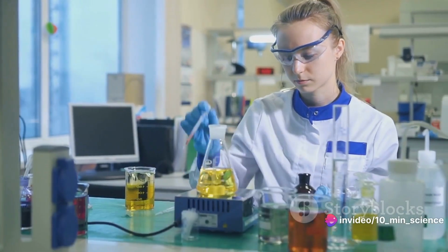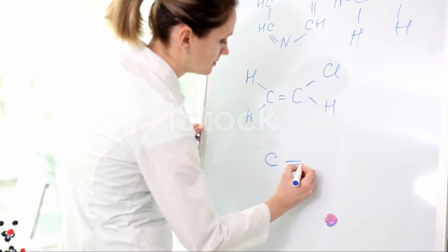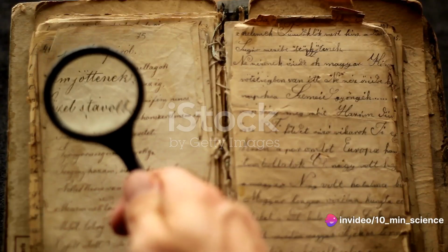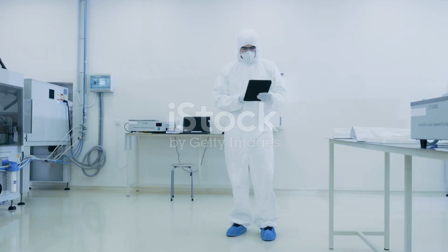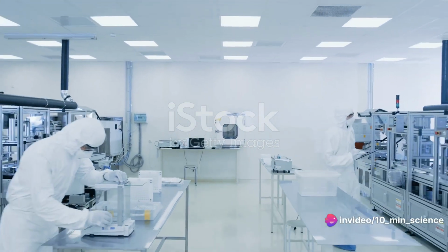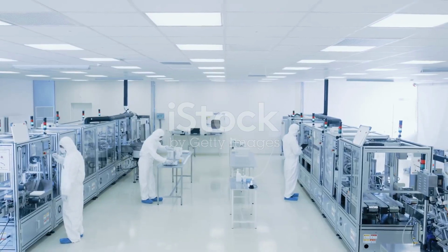That concludes the sections of USP Chapter 621. We've journeyed through the depths of USP Chapter 621. Now let's summarize what we've learned. We've unpacked the fundamentals of chromatography, a vital separation technique in the pharmaceutical world. We've dived into the complexities of USP Chapter 621, a cornerstone document that provides essential guidelines for chromatography practices. We've understood the importance of system suitability, which ensures the system's readiness for analysis, and the significance of meticulous chromatographic conditions, which can make or break a chromatographic separation.